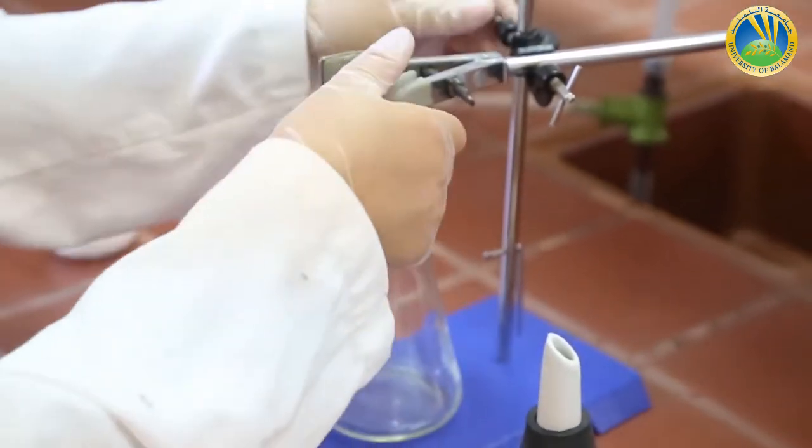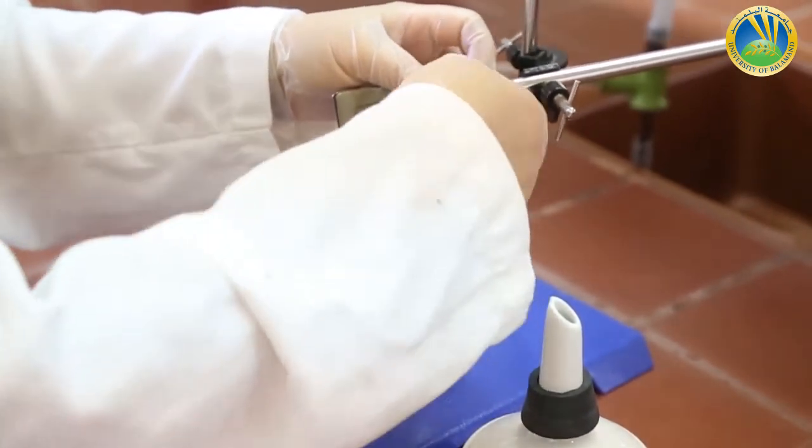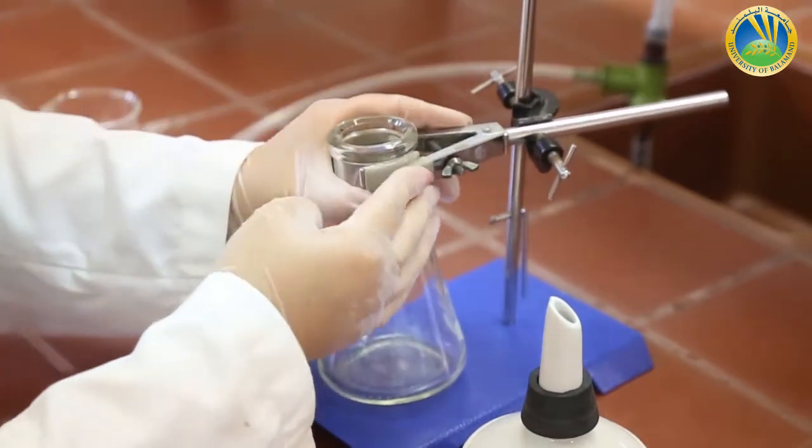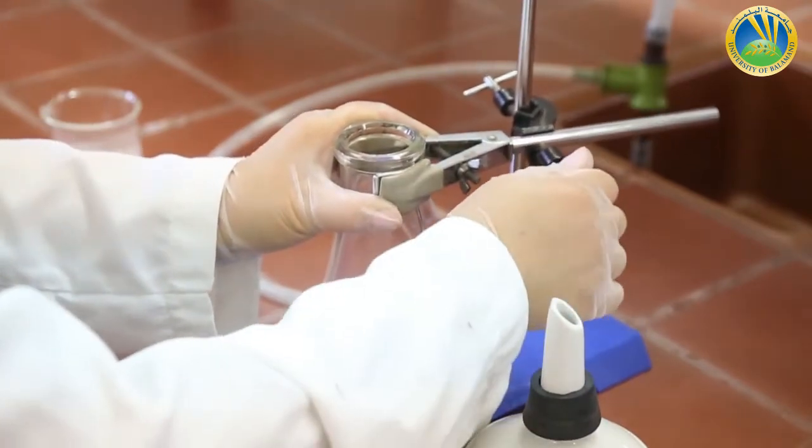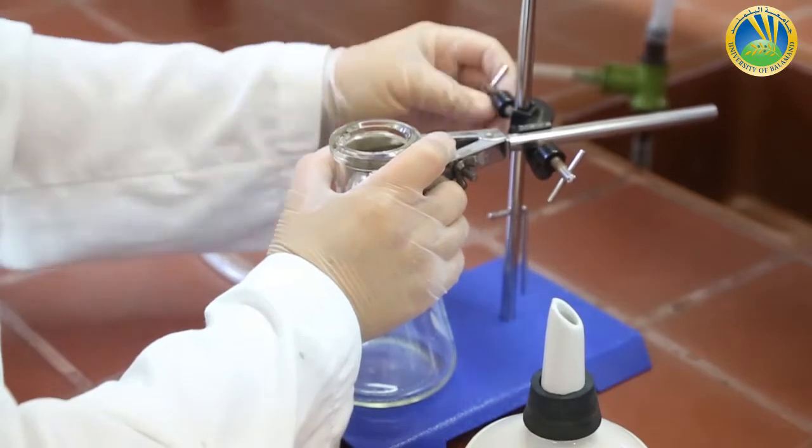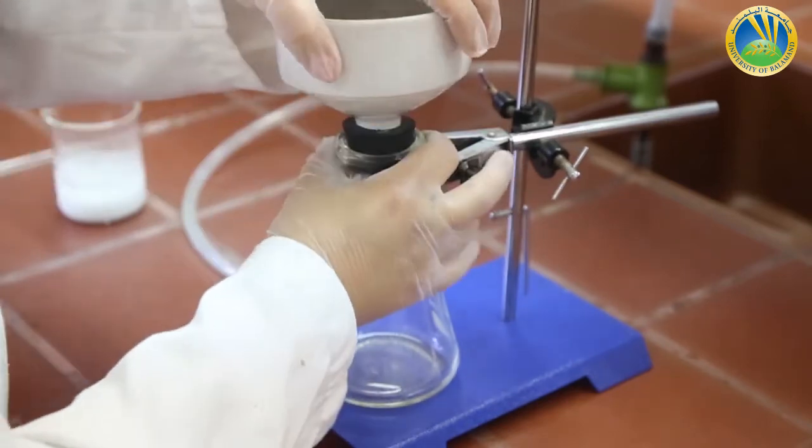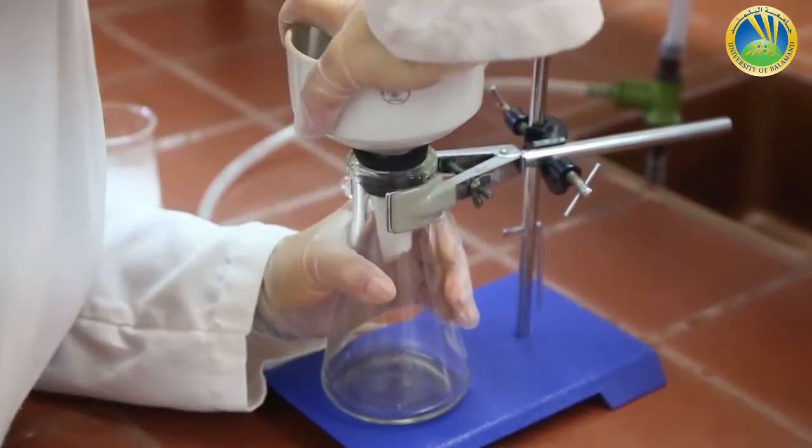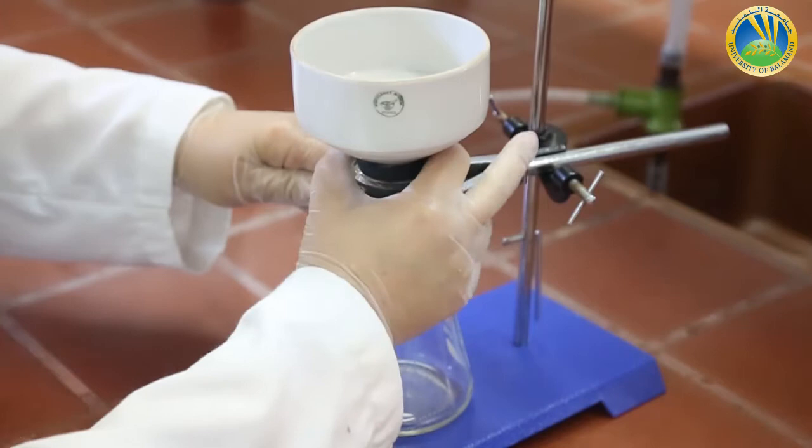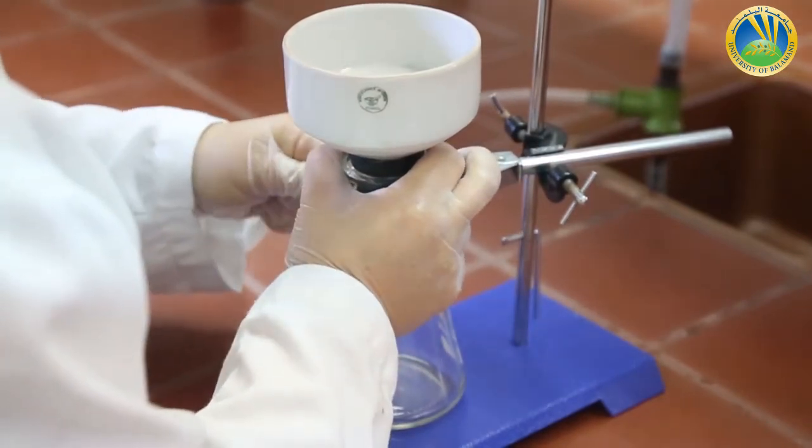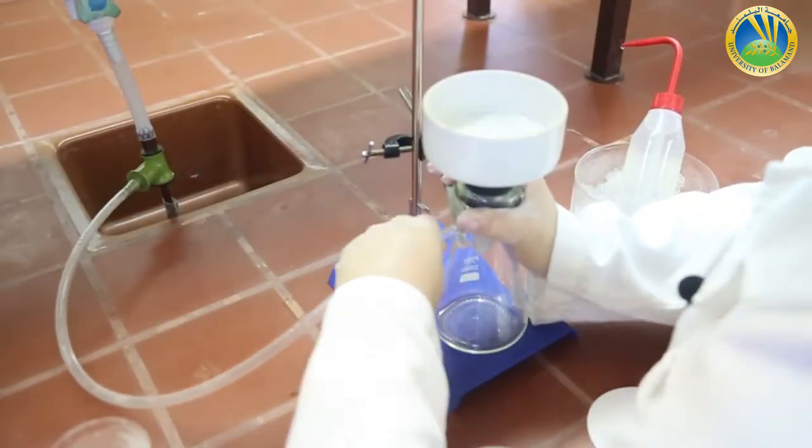First I have to fix the Erlenmeyer flask on the support in the order I told you before. One, two and three. Then I put the funnel of the Buchner filter. I have to connect the vacuum hose.